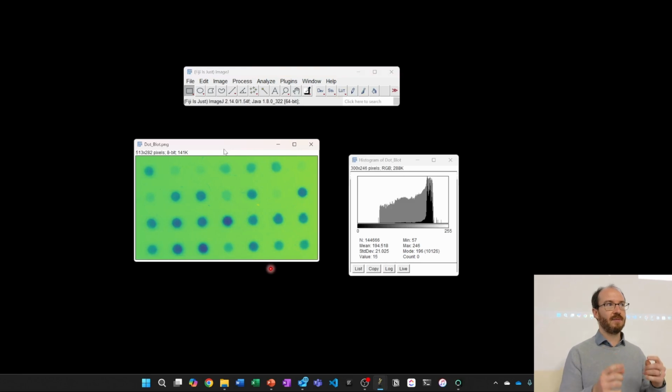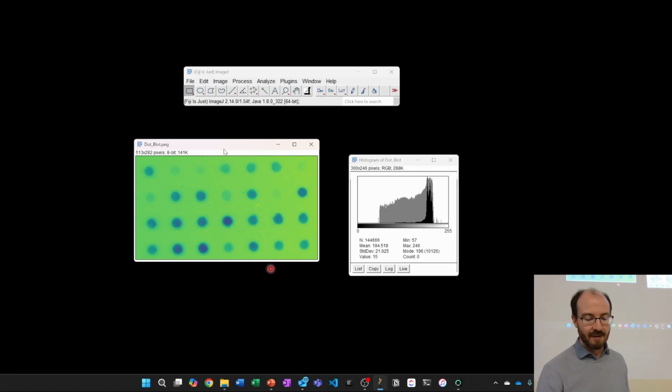As I was demonstrating, our eye doesn't perceive grayscale levels uniformly. We perceive them such that the actual intensity is not increasing at the same rate that we perceive as linear. Viridis is a color map that was designed so that as the intensities increase, your perception of how they increase still stays linear, and that's what you call perceptually uniform.